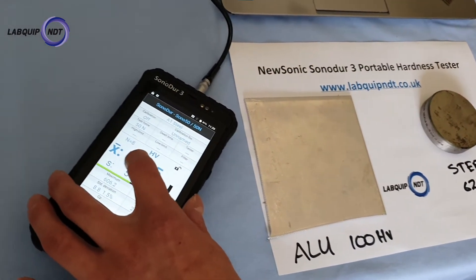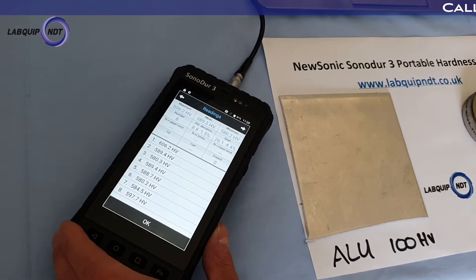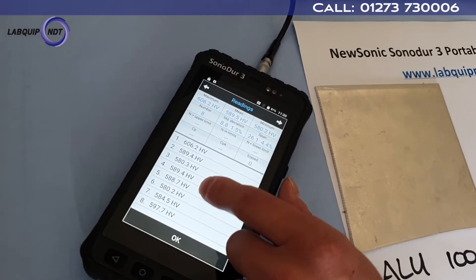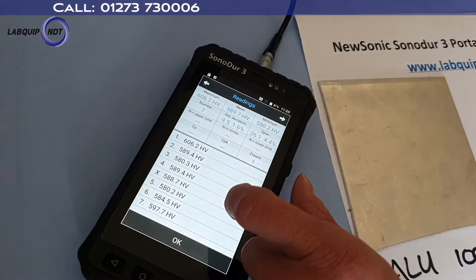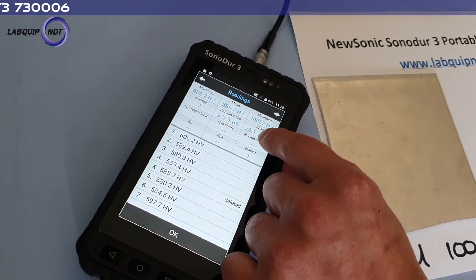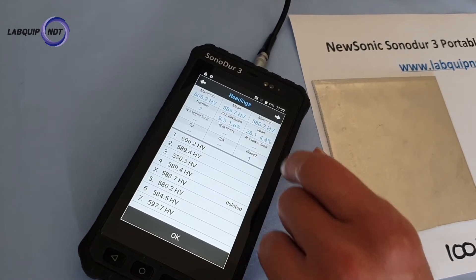As you can see we have a mean value here on the screen. We can click in there and we can either hide some values that maybe aren't so good, and it will bring up a span, a min and max and a mean as well.